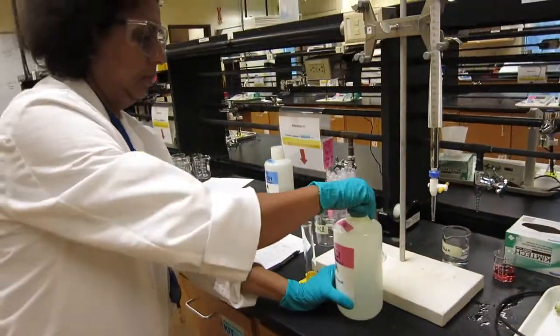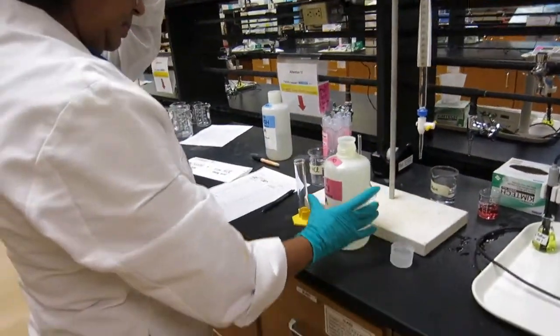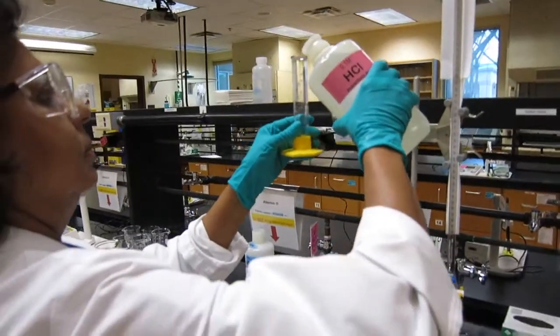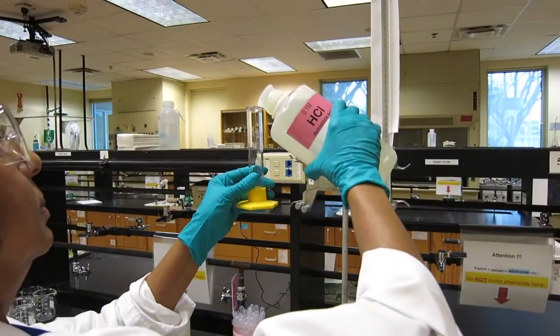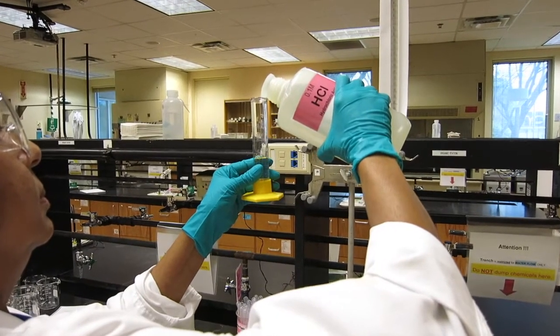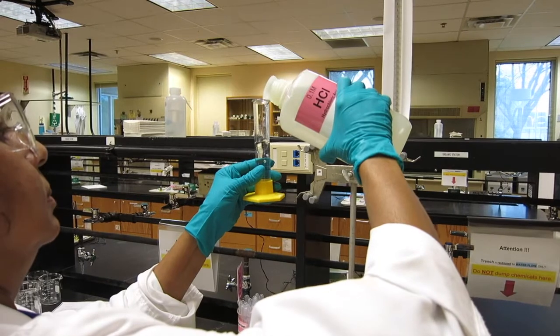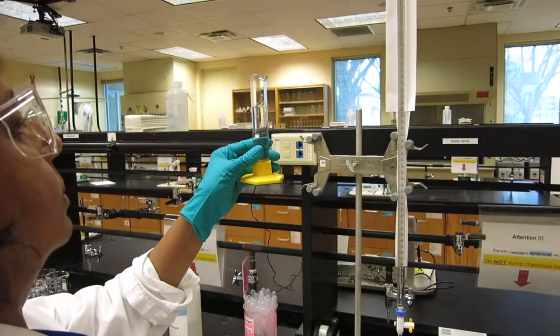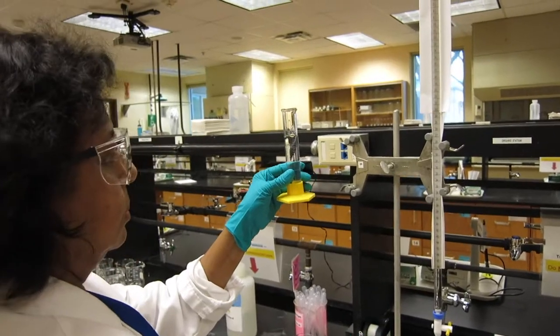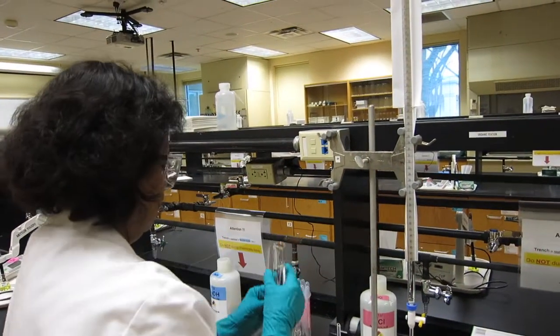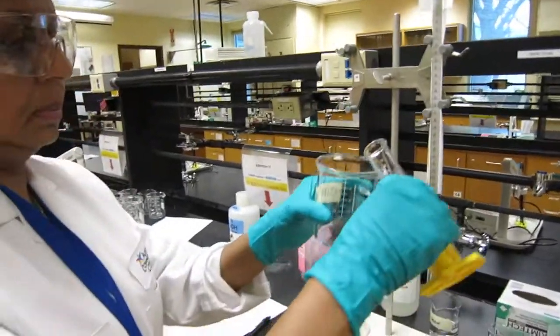Now we're going to pour the 0.1 molar HCl. We're going to measure 25 mL into the graduated cylinder and transfer it into a beaker.